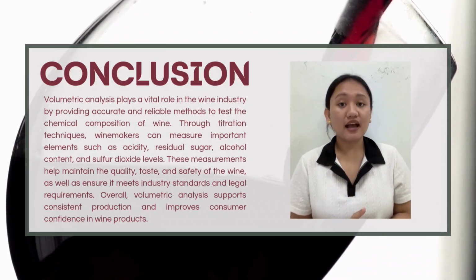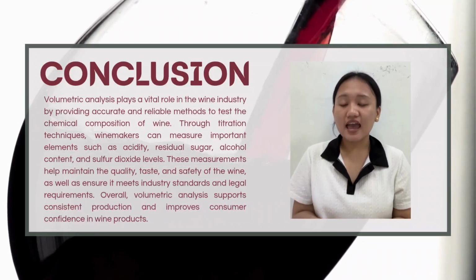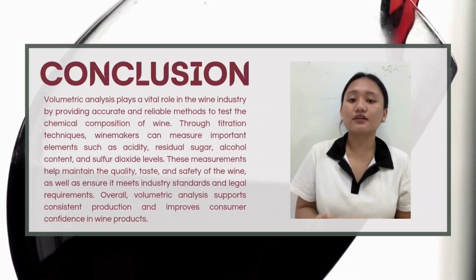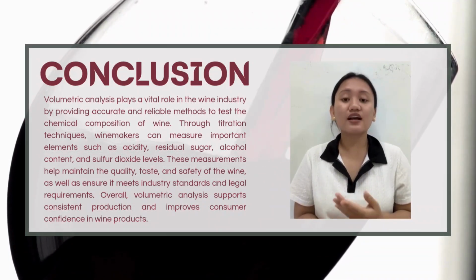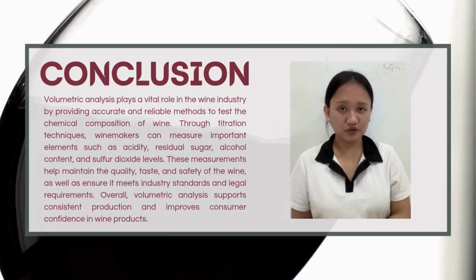These measurements are essential for maintaining the quality, taste, and safety of the wine, while also ensuring it meets industry standards and legal requirements. In the end, volumetric analysis supports consistent production and builds consumer trust in wine products.